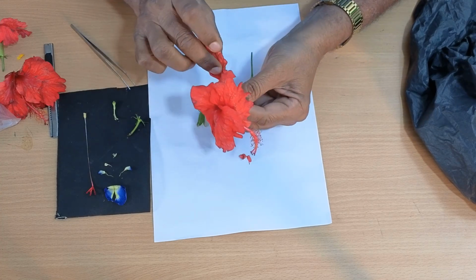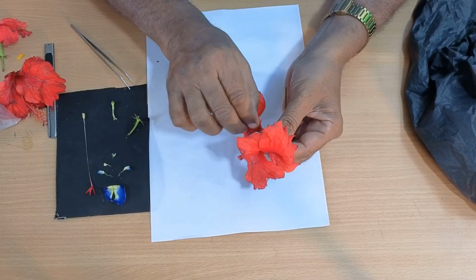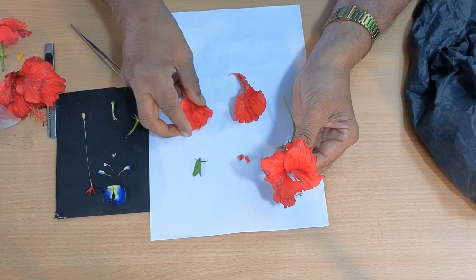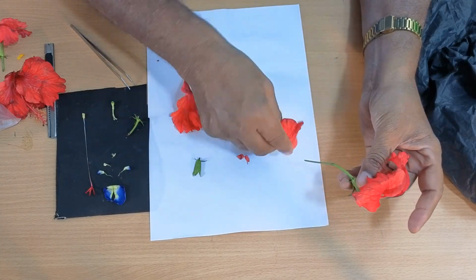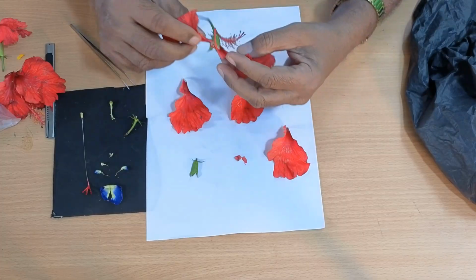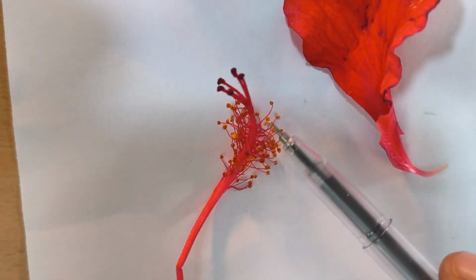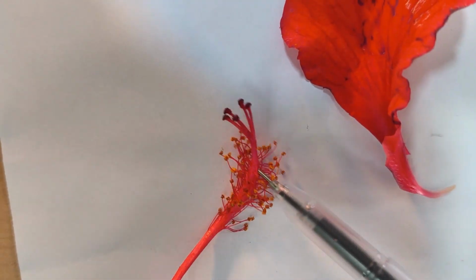Now let me dismantle this one petal, and you have another petal. Yes, you have yet another petal. So here you can find, at the bottom it is very much connected. Here you find all the stamens are very many.